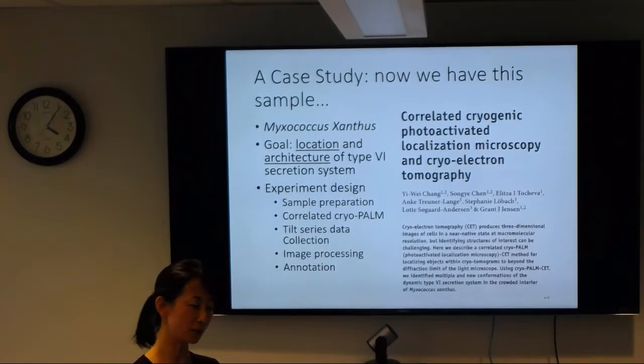I don't know how many years old it is, several years. But it's still one of the very few applications applying super resolution fluorescence imaging in correlation with tomography. CLEM application now is not that rare anymore. Many facilities have it, many labs are doing it.